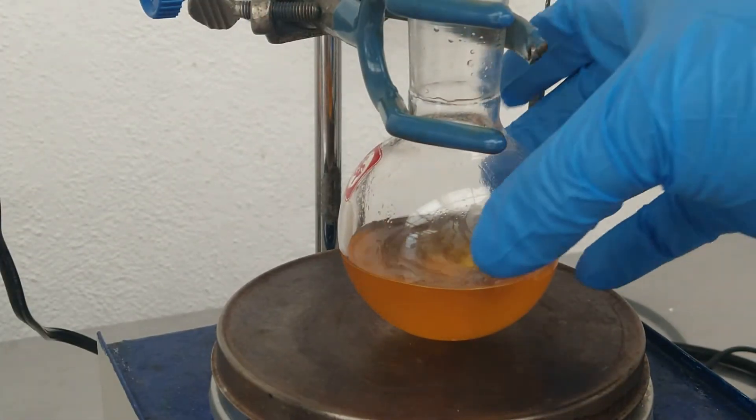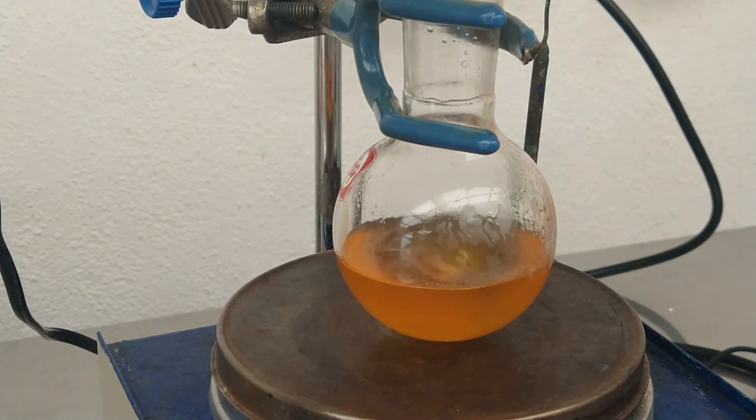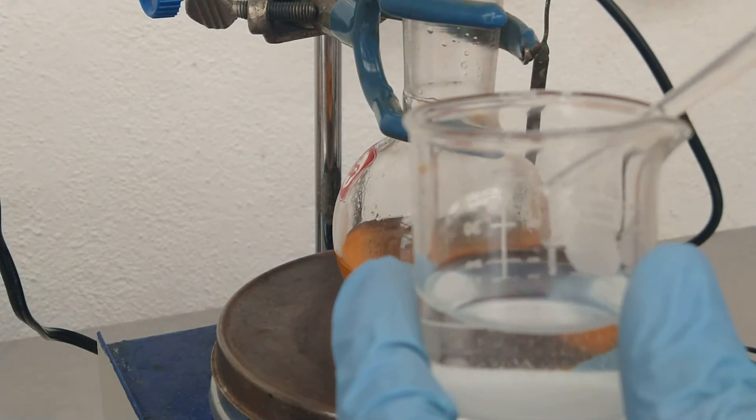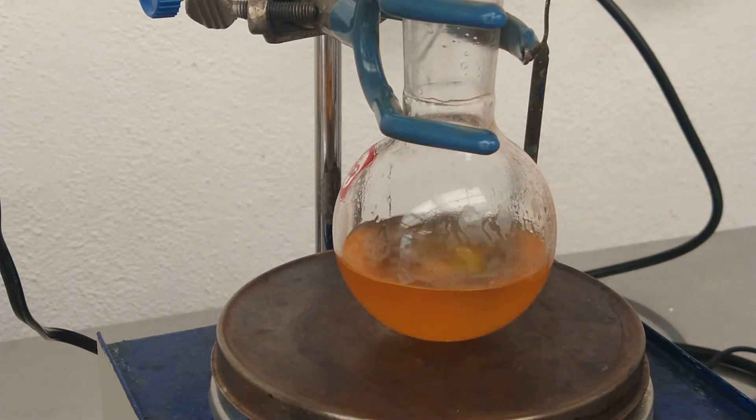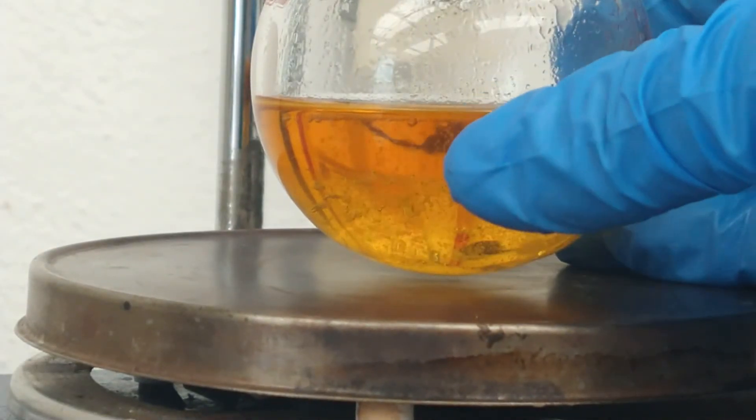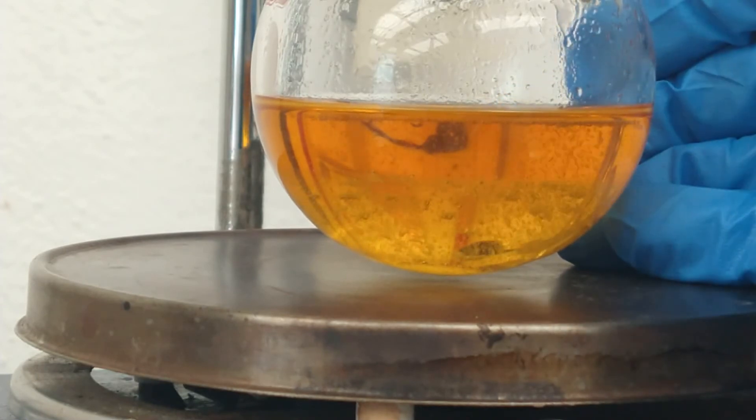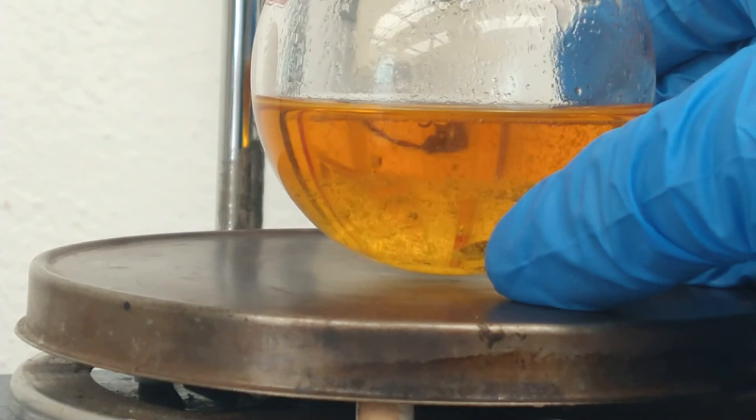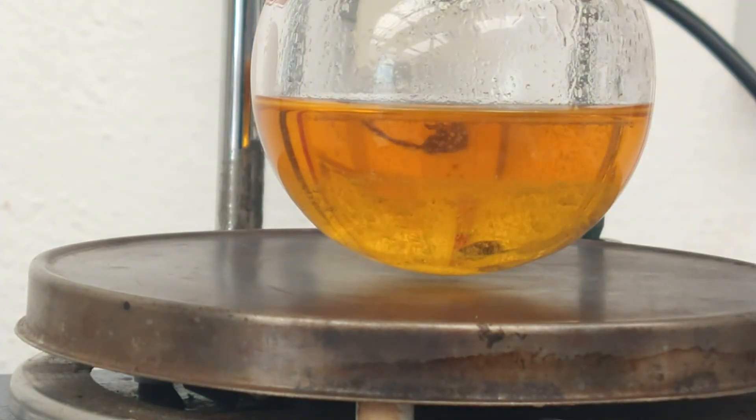Once the solids have been completely dissolved, we can proceed to check the pH with some pH papers. In this case the reaction is slightly acidic, so we can adjust it with a tiny amount of solution of sodium bicarbonate until no more bubbling appears. When all the acids have neutralized, we can observe the formation of two layers in which the upper layer is our desired product. The lower layer is mostly water and acetate salts. We can now proceed to separate the layers.